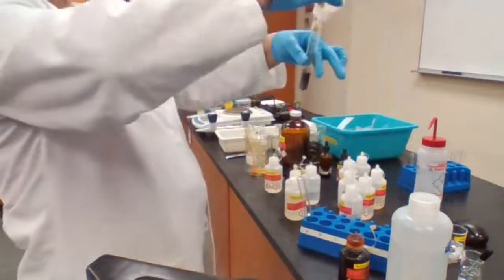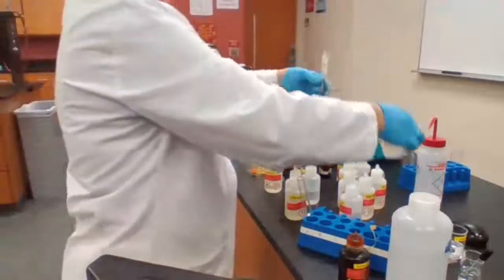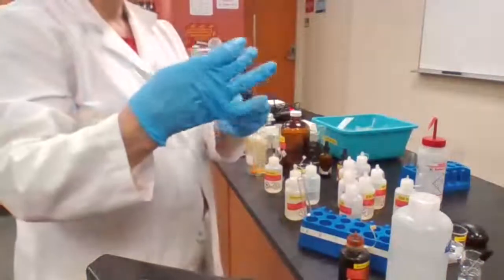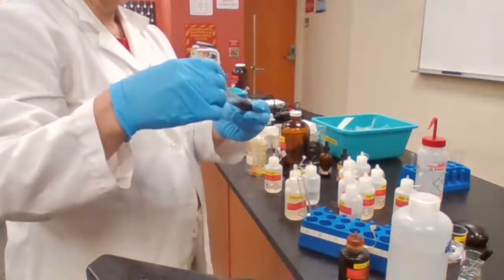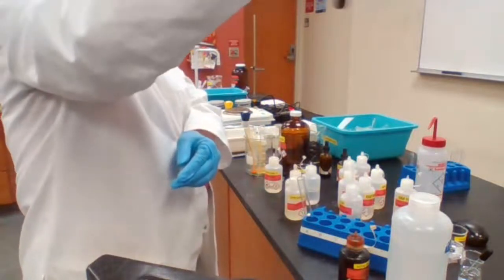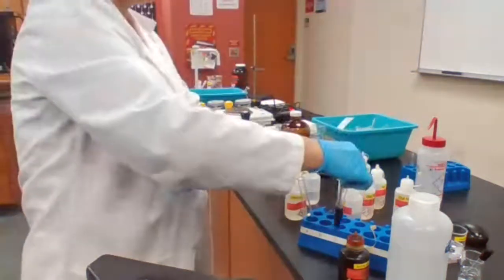We have the answer already, but I just want to make sure that I can get some of that silver forming. Going to leave it alone. And sometimes we have to heat it up.